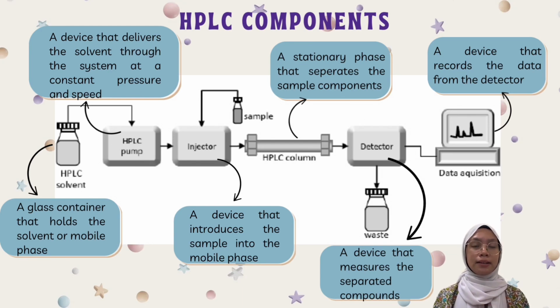Next, we have the detector. It is a device that measures the separated compounds. For the last one, we have data acquisition. It is a device that records the data from the detector.